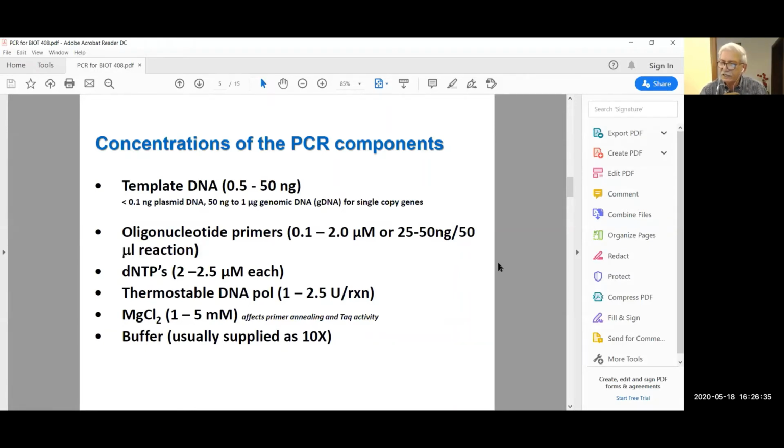So you know what they start telling? They start telling, okay, I used 1 microliter of template, I used 2 microliters of primer, I used 3 microliters of dNTP, 1 microliter of polymerase. This is the typical answer given by a technician, okay? And you must understand how you would answer that. I said that we perform a 25 microliter PCR reaction. In that PCR reaction, you do the calculations in the beginning, okay? Calculations for what?